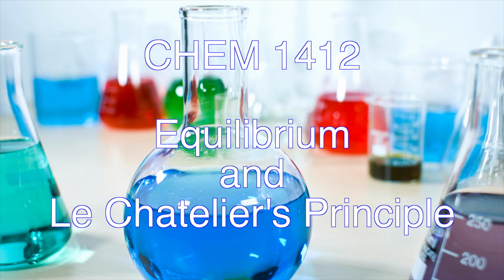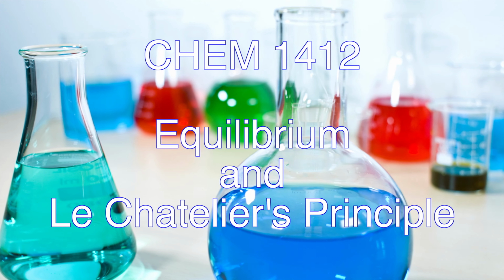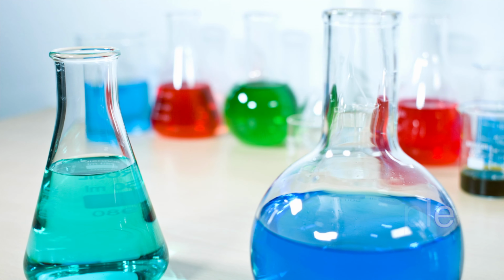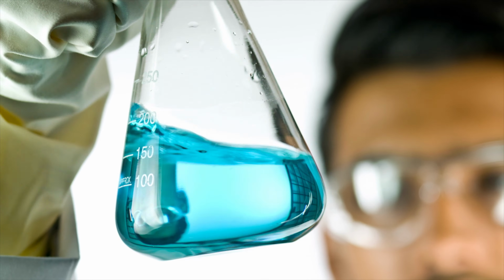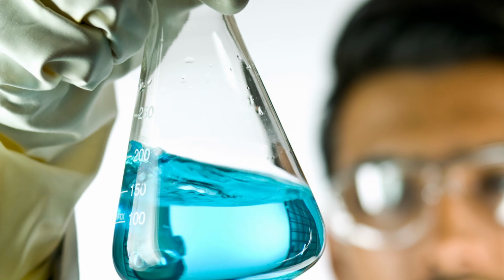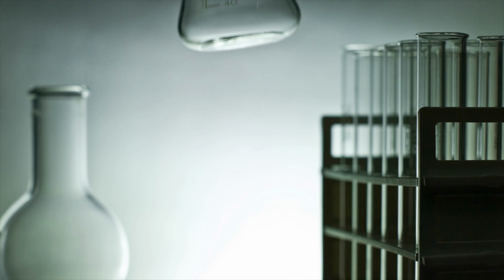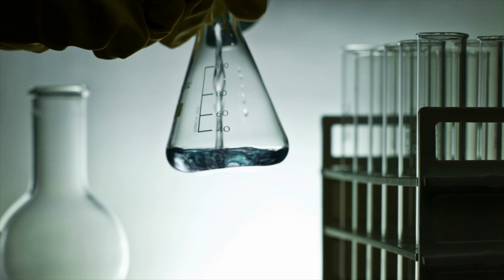Equilibrium and Le Chatelier's principle. A copper(II) chloride aqueous solution is in equilibrium with copper hexahydrate. This lab investigates how this equilibrium can be shifted to the right or left by changing the temperature and concentration of the reactants or products.